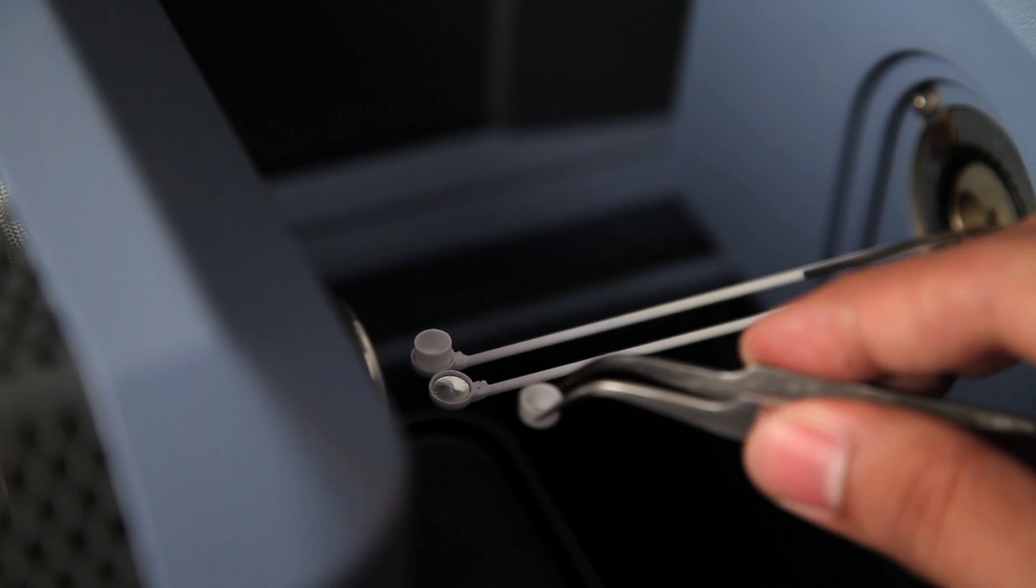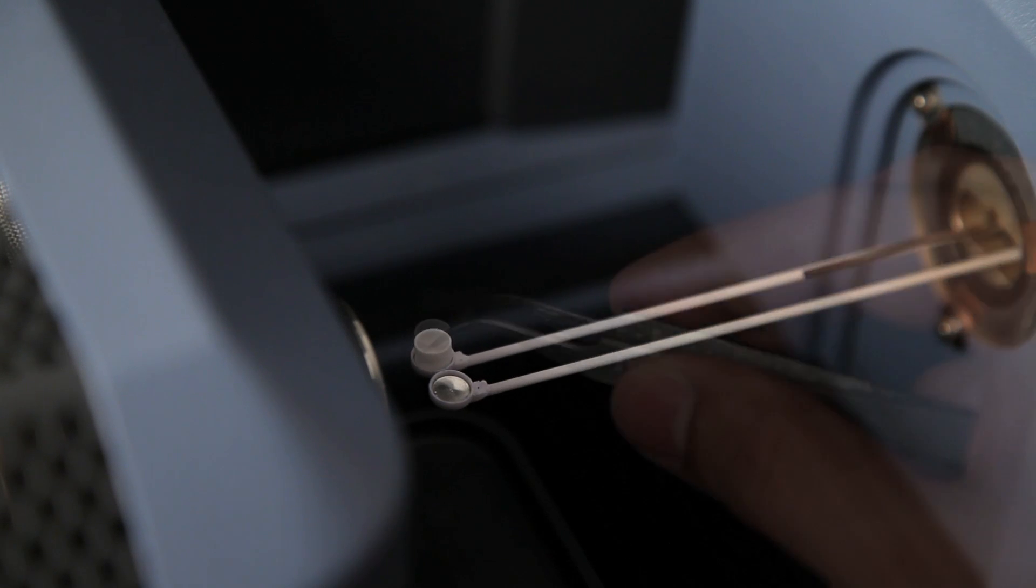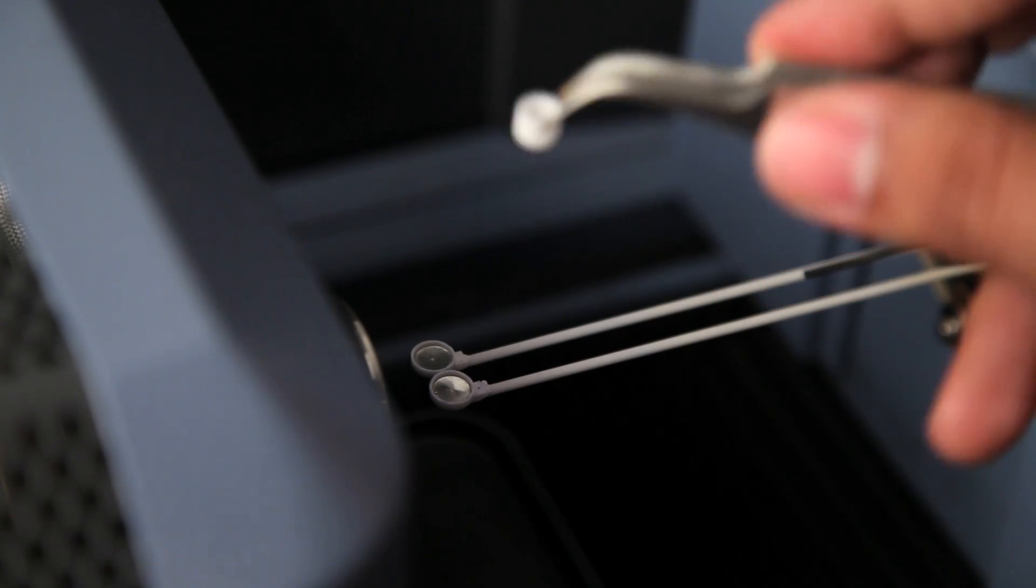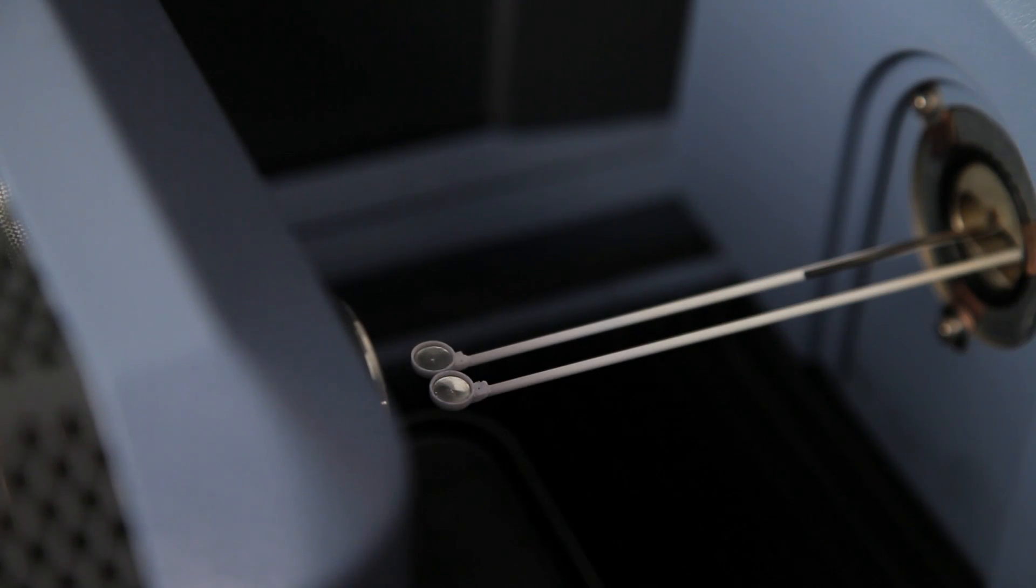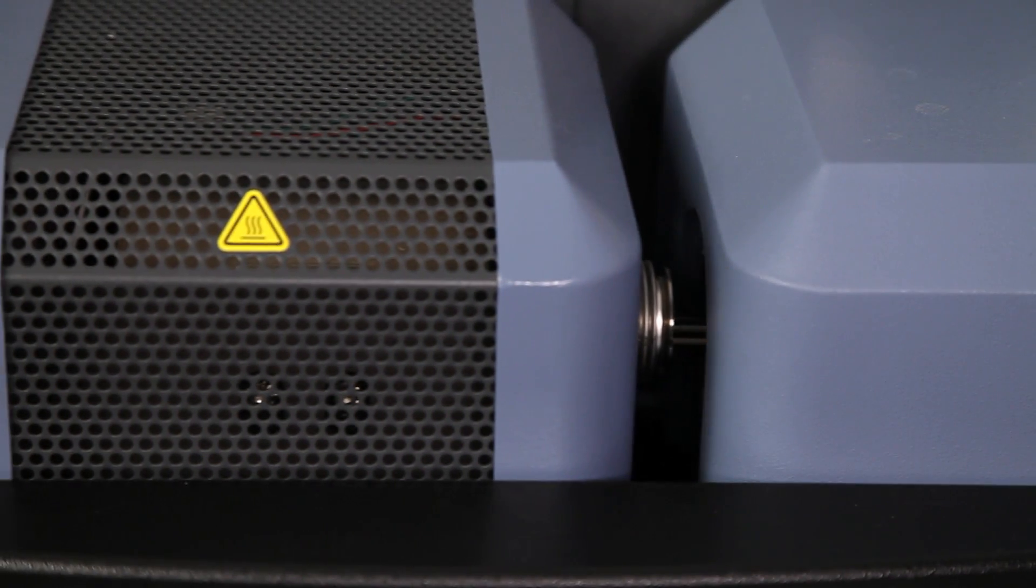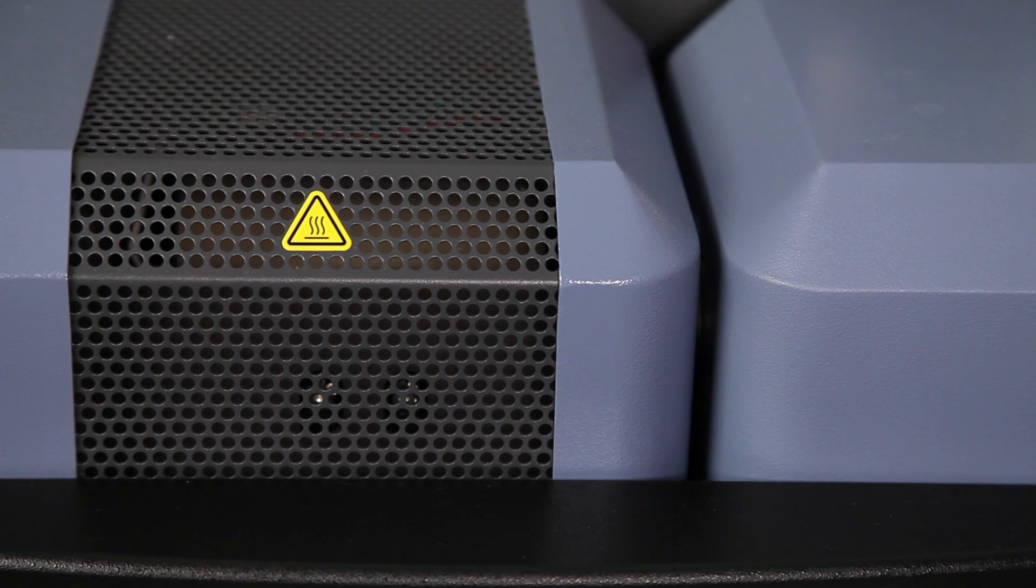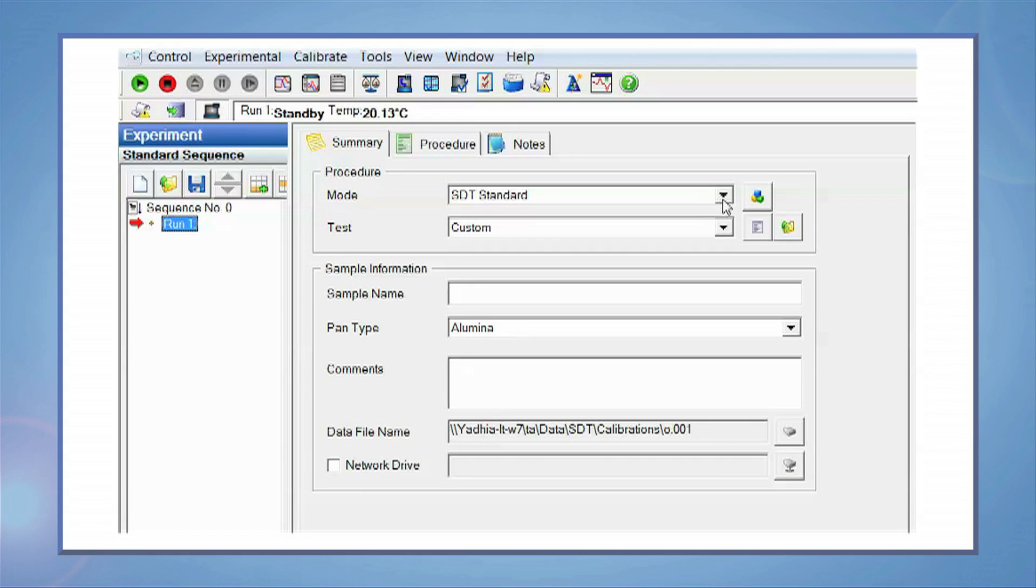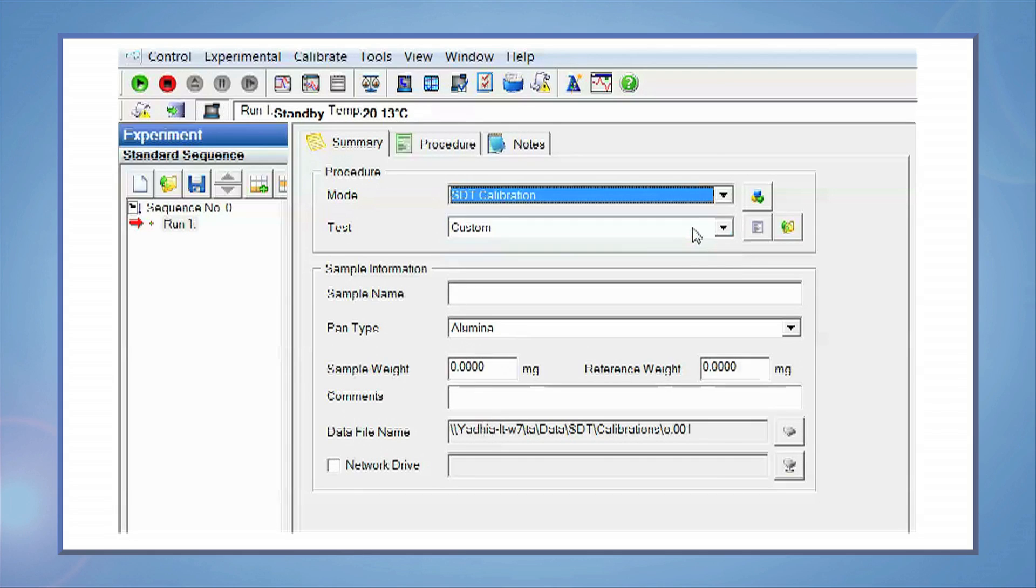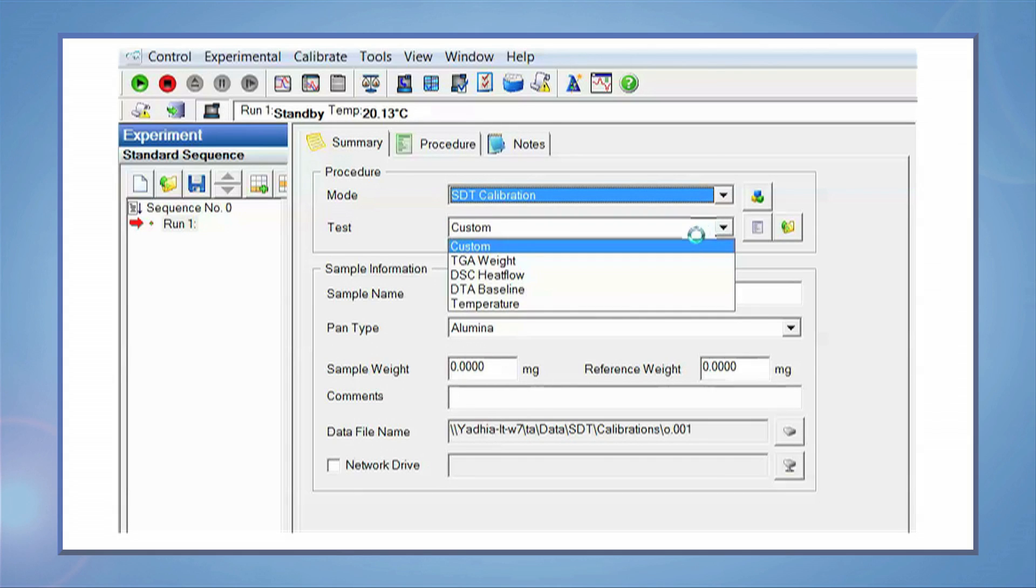Begin the test by removing all STT cups and weights from the sample and reference beams. Close the furnace and set the mode to STT calibration in the instrument control software. Select the test type as TGA weight.